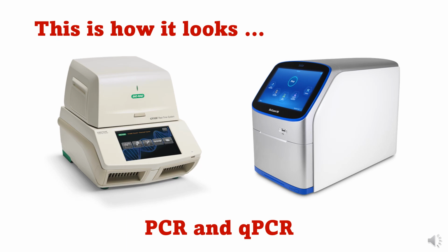So in PCR we generally amplify and make some cDNA, and in qPCR we can even do one step, or we can have an amplification graph, and we can examine quantitatively what the level of gene expression is.